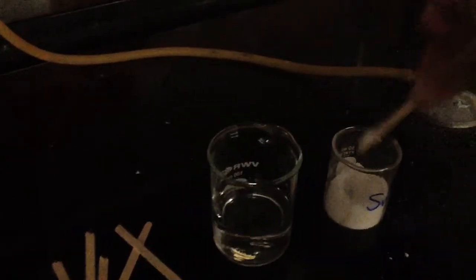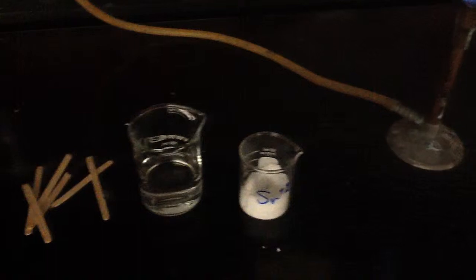Our next chemical is Sr — strontium. Get our stick wet, get the chemical on the stick, and place it in the flame. This one is more like a pure red instead of pink red. The lithium had more of a pinkish tint to it; this one was more like just a pure red.